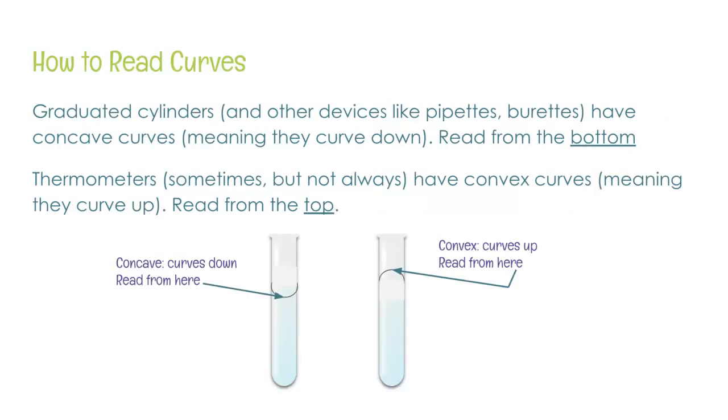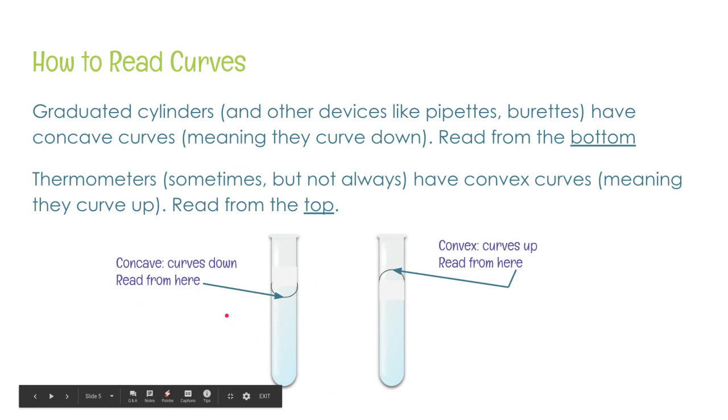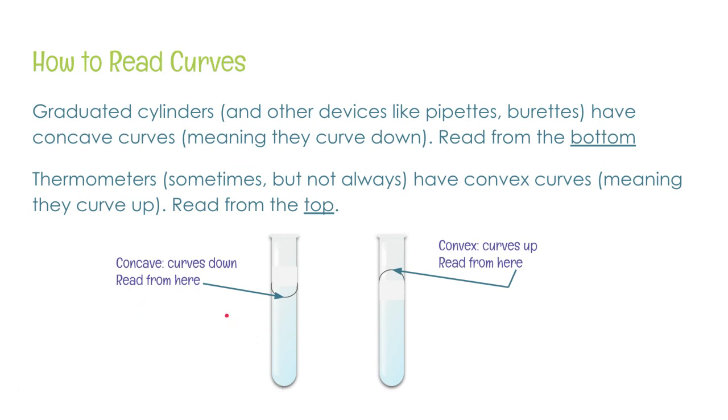So reading curves, you've probably been taught this in middle school, but I'm going to remind you, graduated cylinders and other devices have concave curves, meaning that they curve down, just like this one right here. You don't really need to know the difference between concave and convex. You just need to know that if your curve is dipping down, that you read the bottom. And then in your thermometers, you're going to have convex curves, which means they curve up, and you read those from the top. So if you're curving down, you read from the bottom. If you curve up, you read from the top.